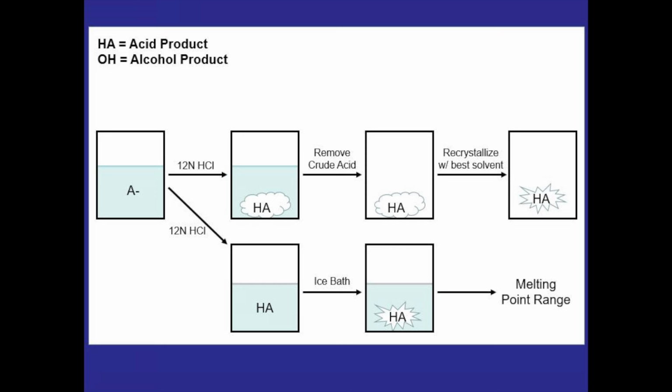If it comes out of solution too quickly, then we might have to recrystallize it afterward, and if it doesn't ever come out of solution, then we'll probably have to start over, being more careful of how much sodium bicarb and aqueous solution we add.